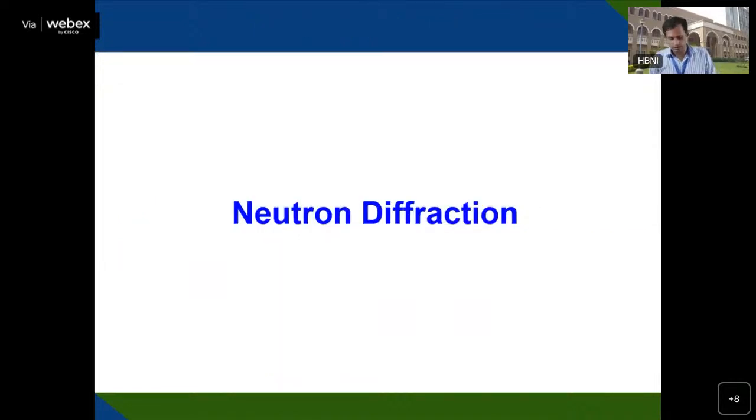I'll now discuss neutron diffraction for the next 10-15 minutes. So far, what I discussed is mainly X-ray based techniques: X-ray diffraction, single crystal as well as conventional powder XRD or synchrotron XRD, X-ray absorption spectroscopy, where I discussed XANES and EXAFS, and then X-ray fluorescence spectroscopy. Those are mainly X-ray based techniques. Now we'll discuss neutron diffraction.